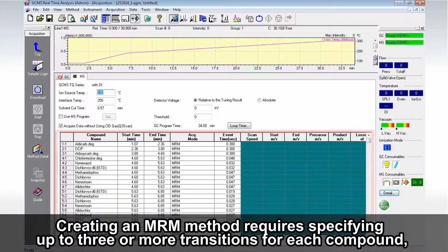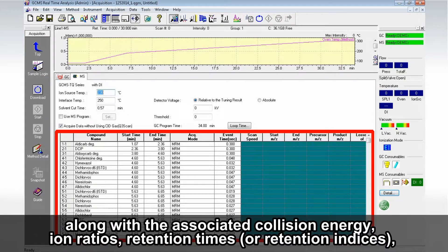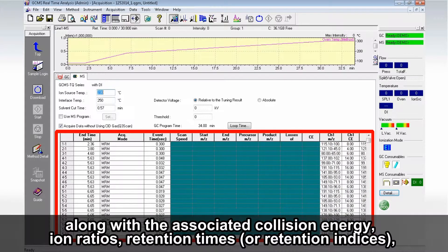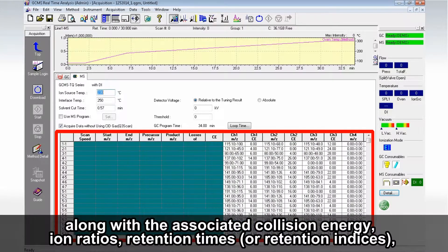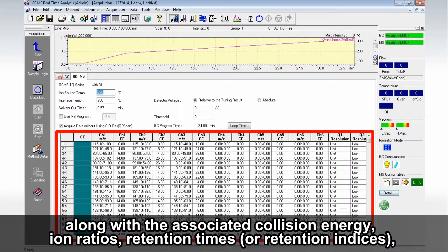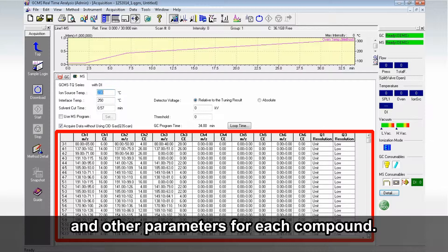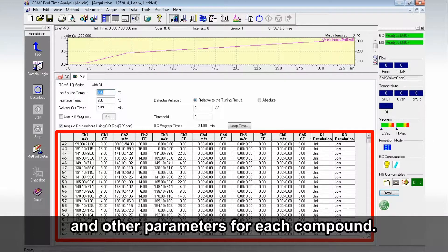Creating an MRM method requires specifying up to three or more transitions for each compound, along with the associated collision energy, ion ratios, retention times or retention indices, and other parameters for each compound.